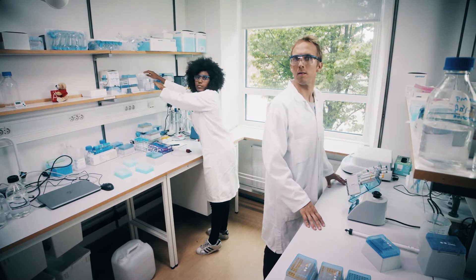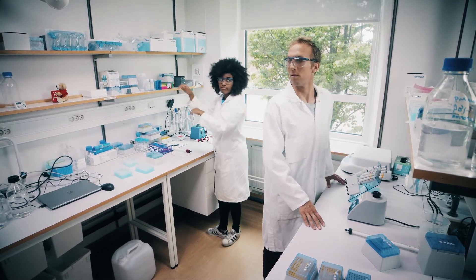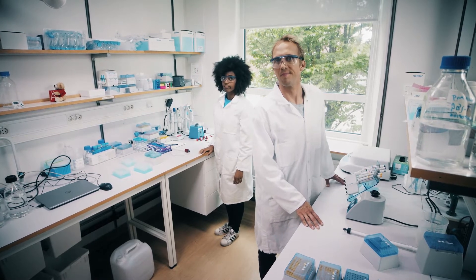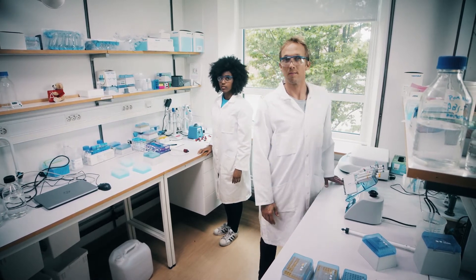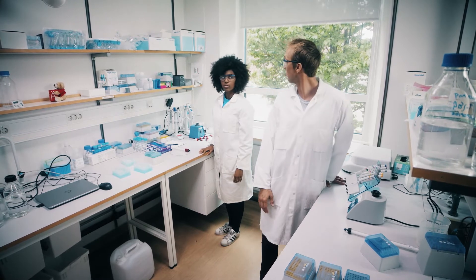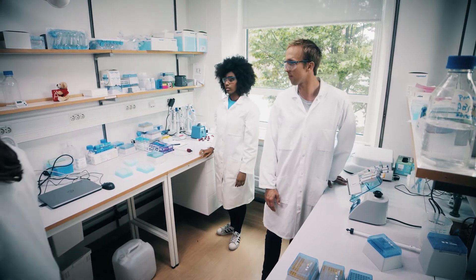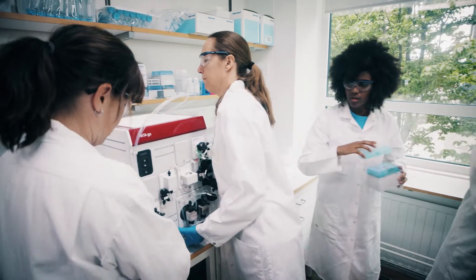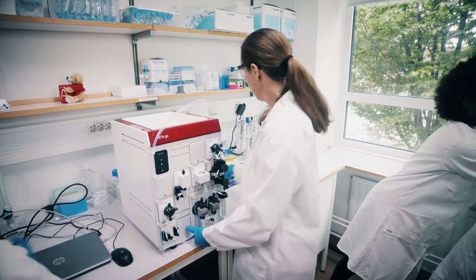Hi there. Are you running out of space in your lab with all the routine protein purification work you have to do? Well, cheer up — there is help at hand. Here it is, ÄKTA go, the latest member of the world-famous ÄKTA system family.